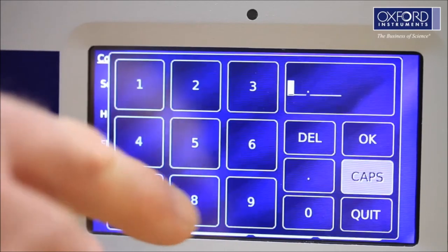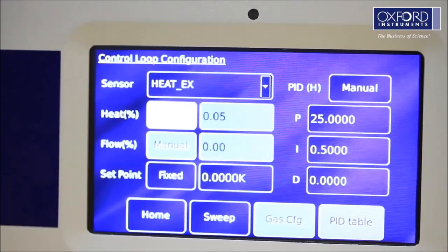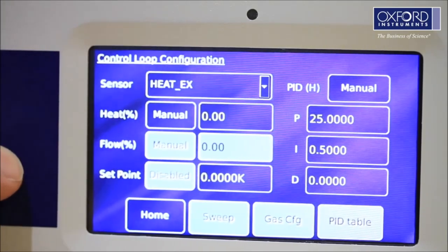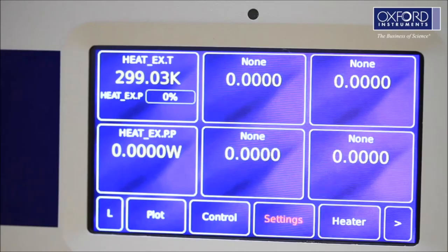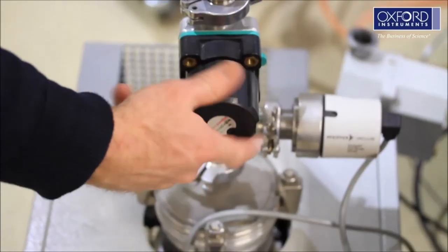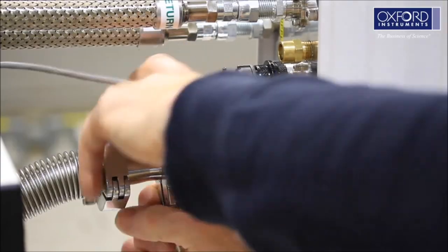When the cryostat pumping is finished, stop the 300 Kelvin temperature control and set the temperature to 0 Kelvin and manual mode. Close the OVC vacuum valve, turn off the vacuum pump, and disconnect the pumping line.